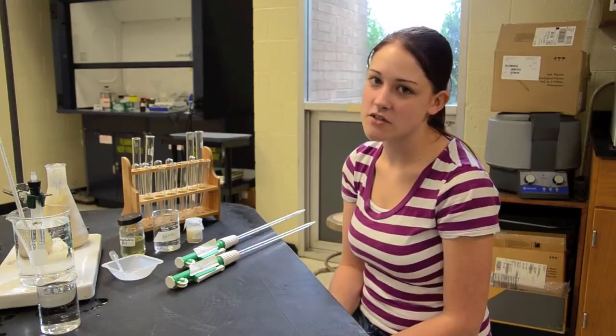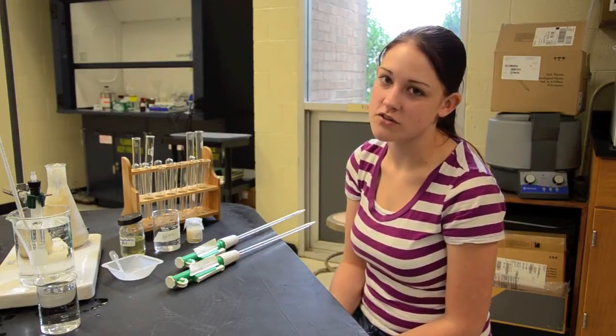Welcome to the Maryville College Lab. Today I'm going to show you how to make your yeast suspension for your yeast fermentation lab.